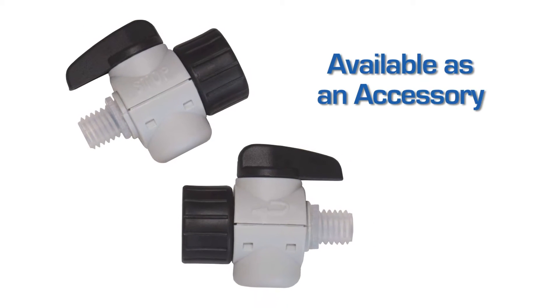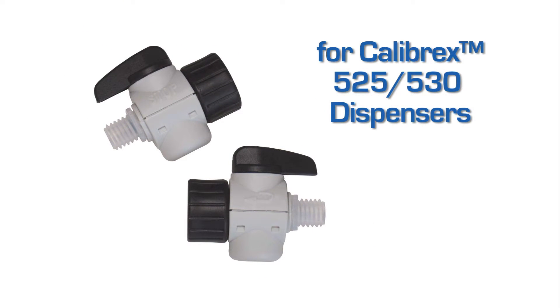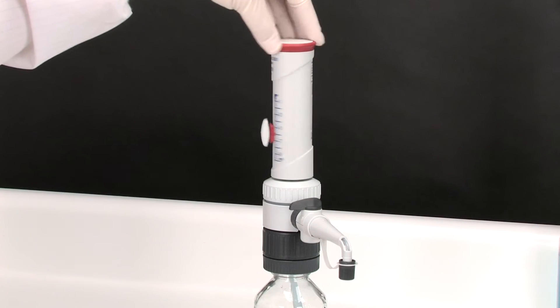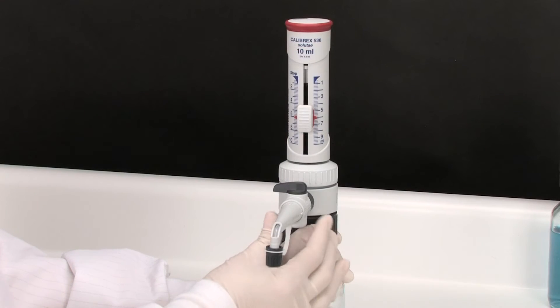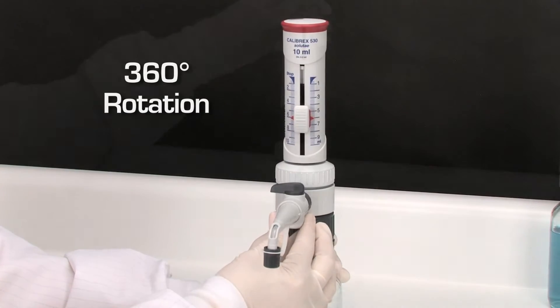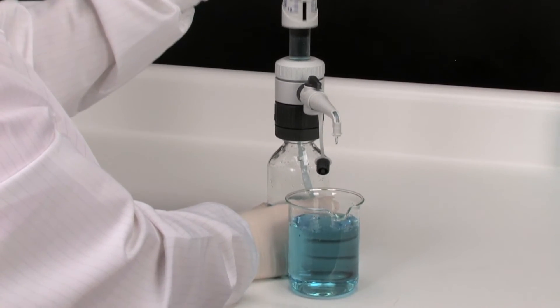The stopcock is available as an accessory and can be mounted anytime on Calibrex 525 and 530 dispensers. The dispenser rotation provides maximum working flexibility, and the delivery jet can be positioned as needed over 360 degrees. The precision machined parts enable very soft dispensing movements.